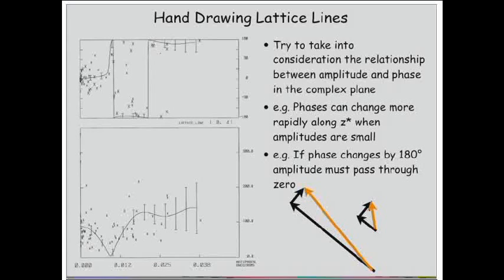So if you're fitting the amplitudes by hand, and we've got rather low amplitudes here, you can expect quite reasonably that you get much more rapid changes in phase. So check that that makes sense, that that's all happening.